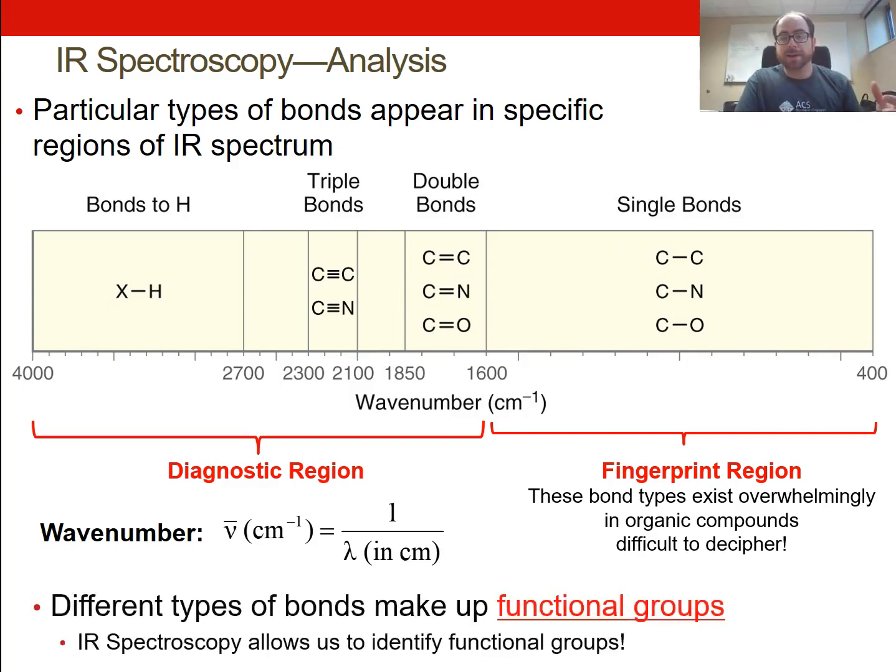So with that, IR spectroscopy tells us essentially what functional groups exist in your molecule. And this can be important if we're isolating or trying to purify different molecules. So that should contain just the functional groups of our desired compound. And then later in the semester, when we talk about reactivity, what we're doing is essentially converting one functional group to another functional group. So we can take an IR spectrum of our product and identify whether that reaction occurred or not.